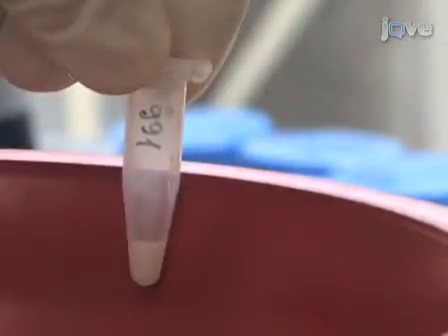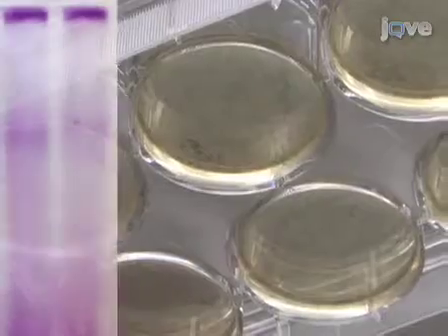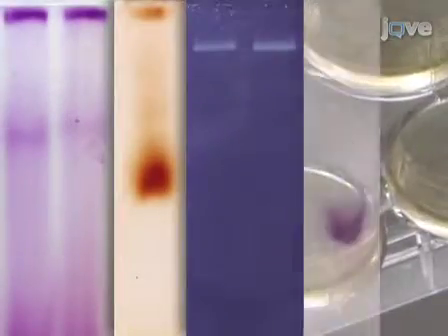This procedure involves isolation of a crude mitochondrial pellet from human embryonic stem cells, separation of mitochondrial complexes of the oxidative phosphorylation system with high-resolution clear native polyacrylamide gel electrophoresis, and subsequent in-gel activity assays. So, let's get started!